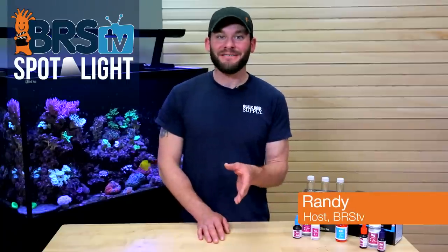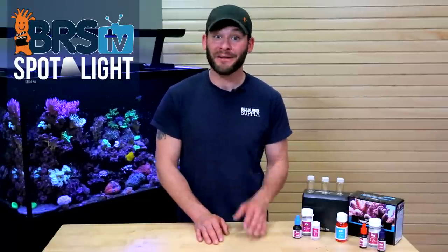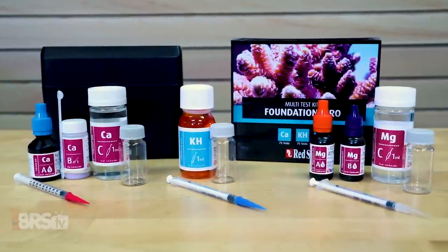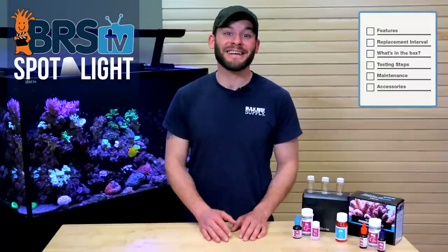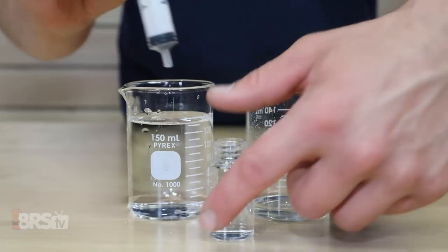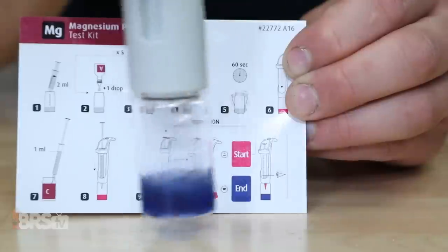Hi guys, I'm Randy with BRS TV, and today we're testing our reef tank's water with one of the most easy and accurate titration style test kits currently out there, the Red Sea Foundation Pro multi-test kit for calcium, alkalinity, and magnesium. We'll show you what comes with the kit, walk you through the testing steps for each one, provide you with some time-saving tips and tricks, and discuss a couple of ways to keep them providing the most accurate test results possible.